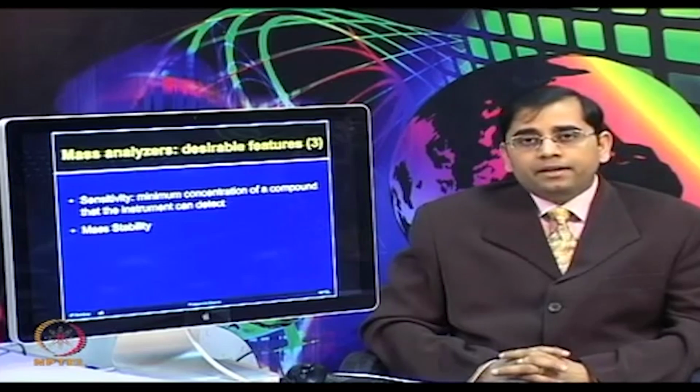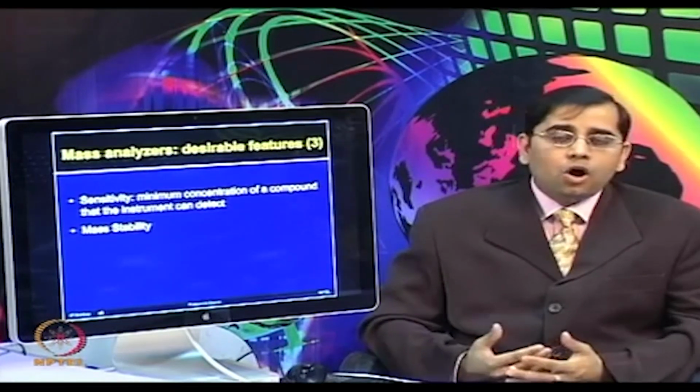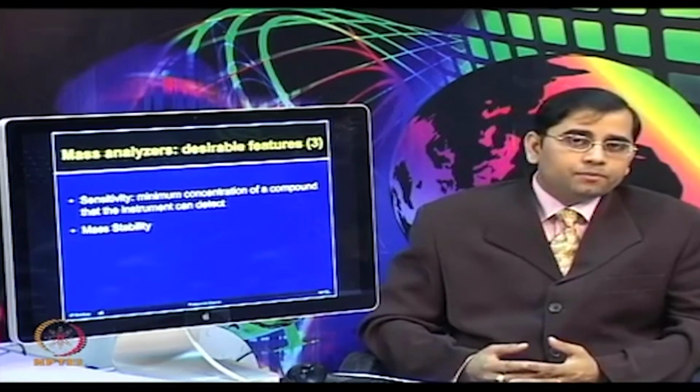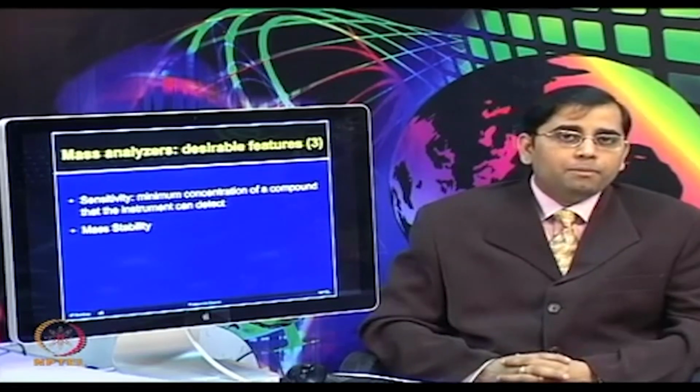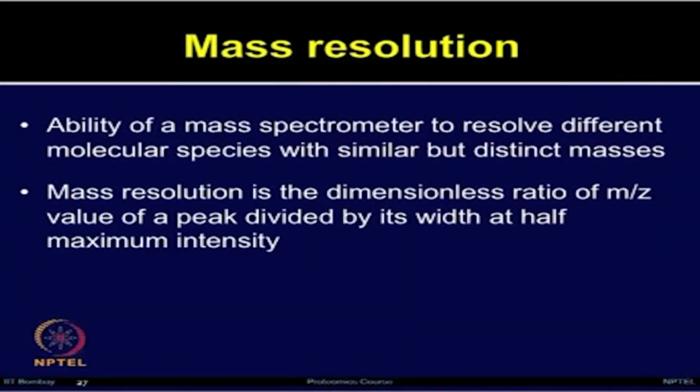So, while you are comparing various types of mass analyzers, one needs to look at all of these parameters, and then only one can decide for what application they can select which type of mass analyzer. While we discussed various properties which are desirable for the mass analyzers, let us talk about mass resolution and mass accuracy in a little more detail.